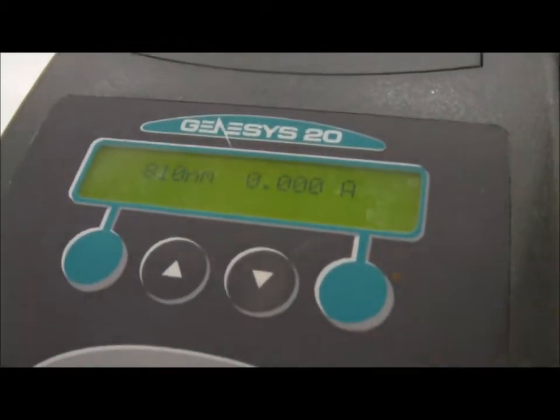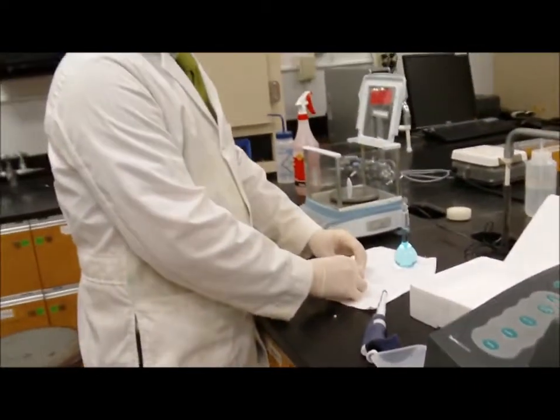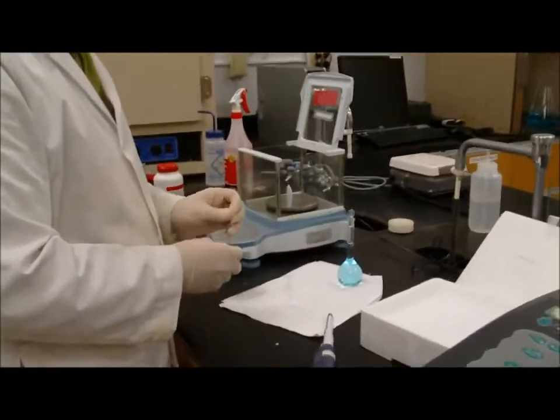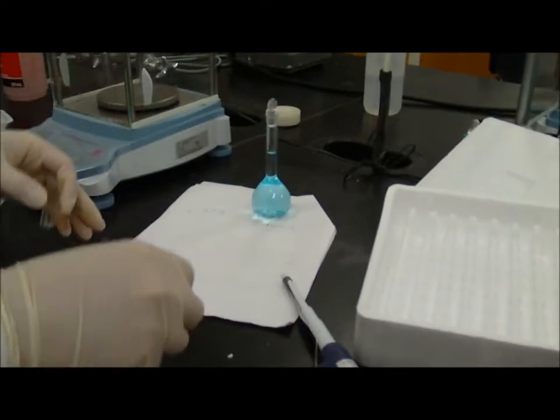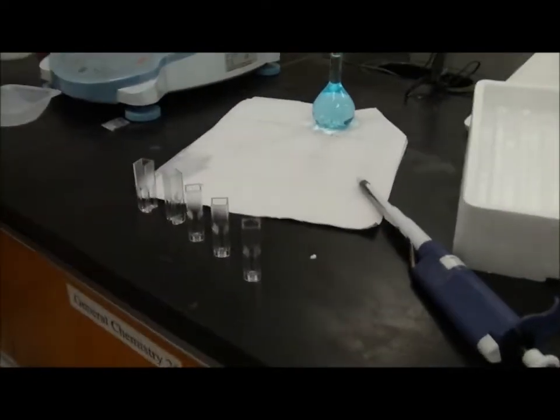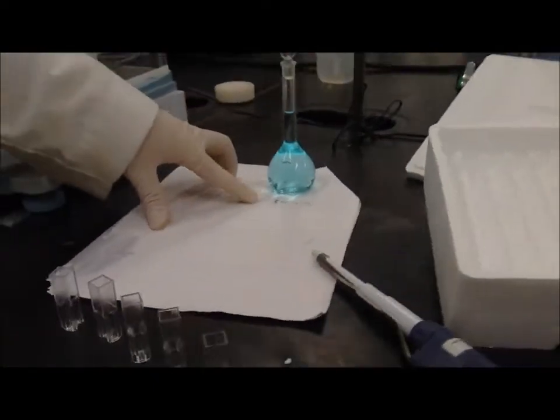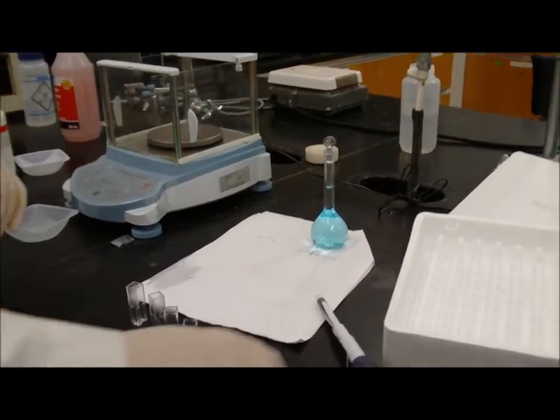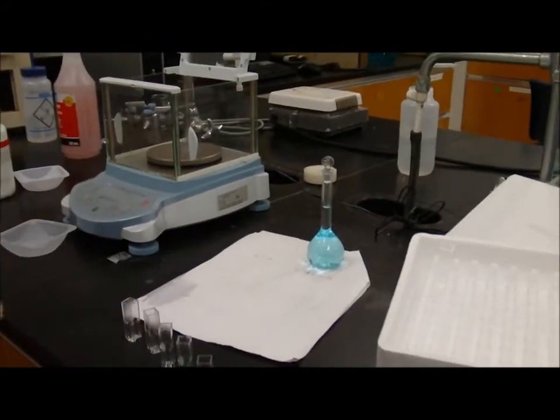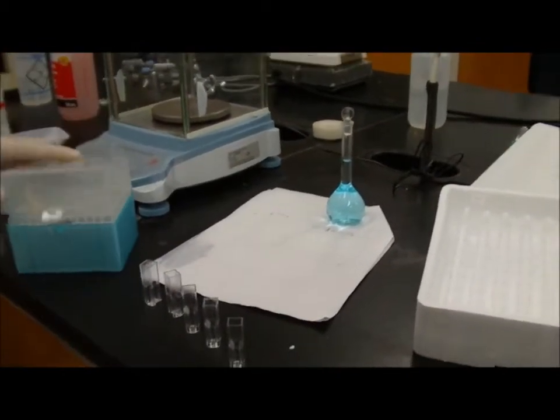All right, so it's blanked at 810 nanometers. Now, I'll get out five cuvettes so that I can make a standard curve. So I make five new concentrations from this stock solution, all right? My stock solution is 0.05 molar, and I'm going to make up 1 milliliter of various concentrations from this 0.05 molar.